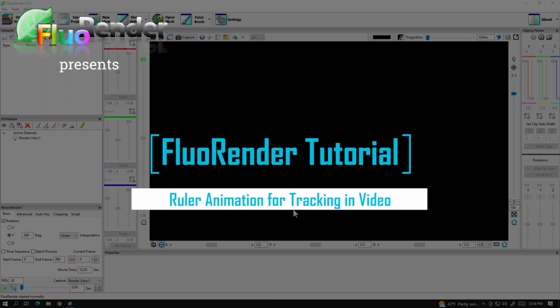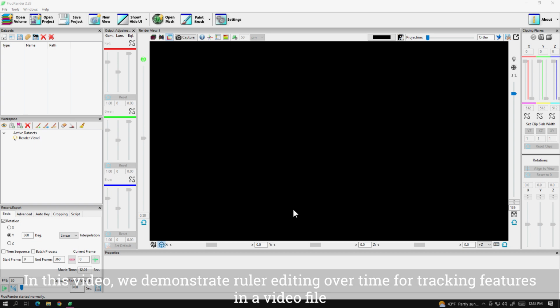FluoRender tutorial. Ruler animation for tracking in video. In this video, we demonstrate ruler editing over time for tracking features in a video file.